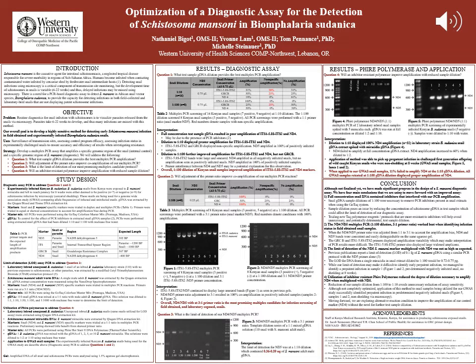However, 2 of the 3 snail markers showed amplicon variability and problems with amplicon visualization during gel electrophoresis, ruling them out for further development. The snail marker taken forward still had amplification bias for the schistosome-specific marker during multiplex reactions. To lead on from this, our second question was, can an adjustment of primer ratio improve co-amplification of our PCR primers? We found that having schistosome-specific primers at a 1 to 3 concentration relative to snail primers worked well for getting equal amplification across markers.